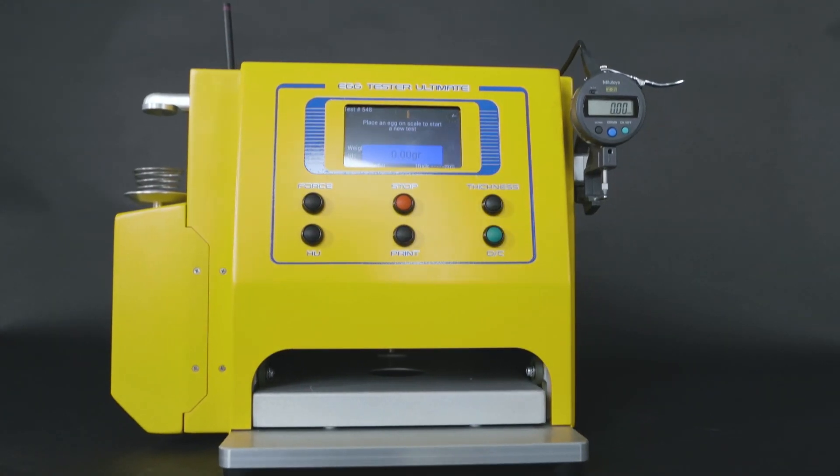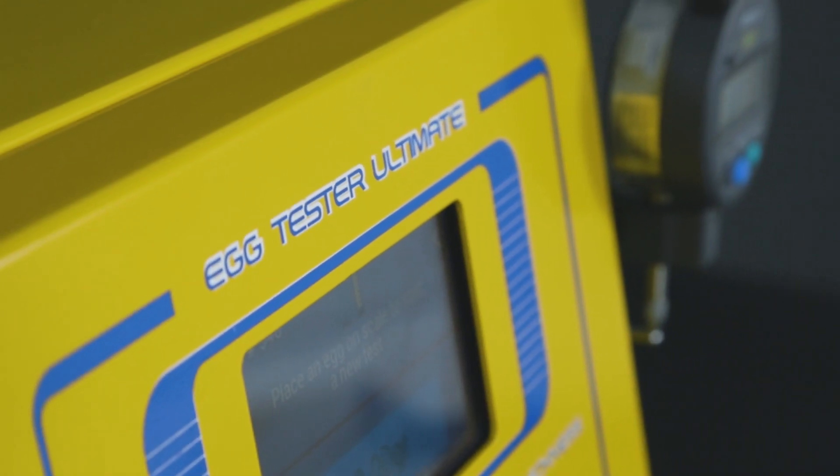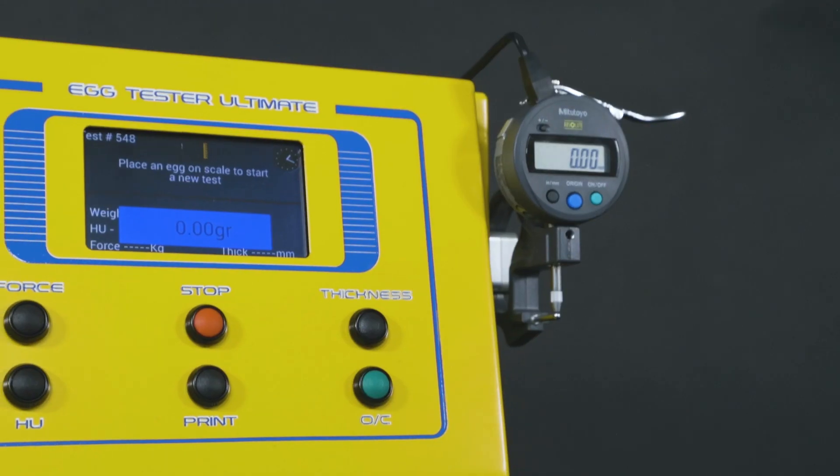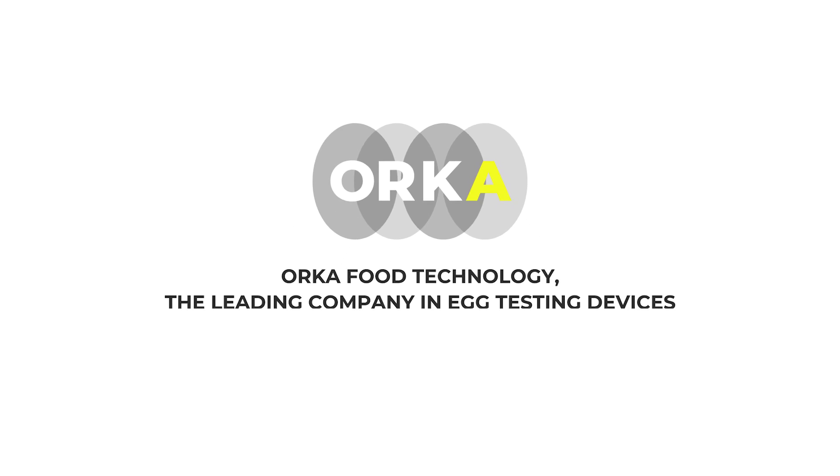As the best full-service egg testing device of its kind, the Egg Tester Ultimate from Orca Food Technology is redefining the industry standard for egg quality control. Learn more at eggtester.com.